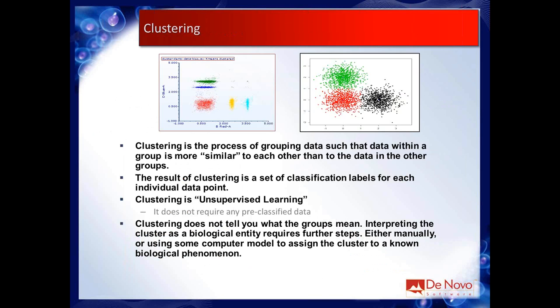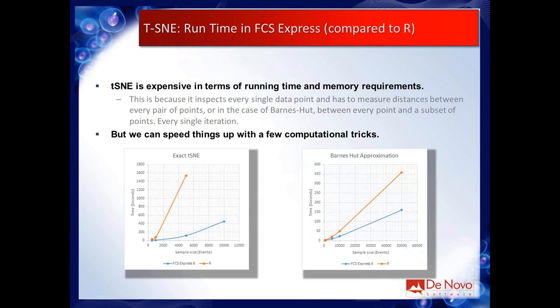A few extra notes I want to say before I pass it back is that try to make sure that you've applied any variance stabilization or normalization before you run tSNE on it. And try to make sure the scaling is pretty similar for each parameter.